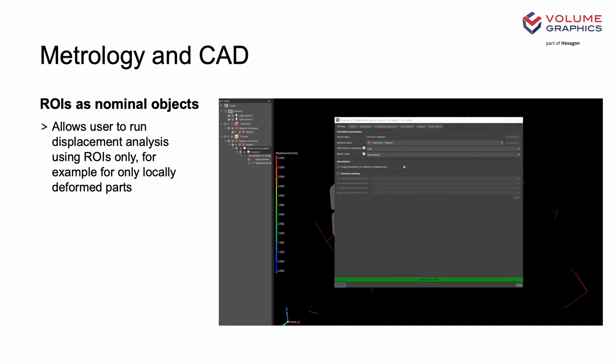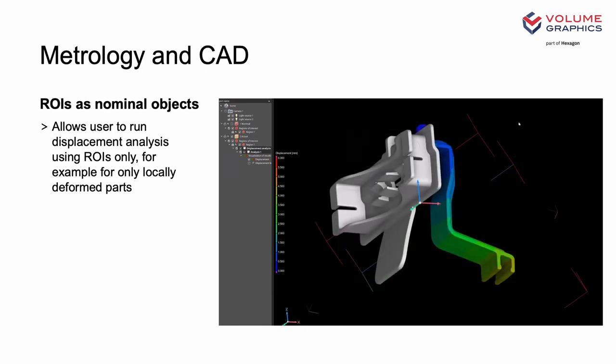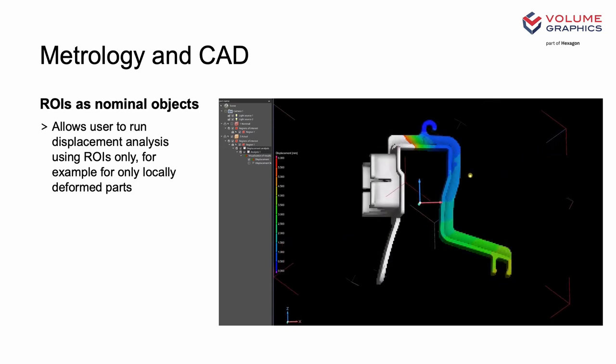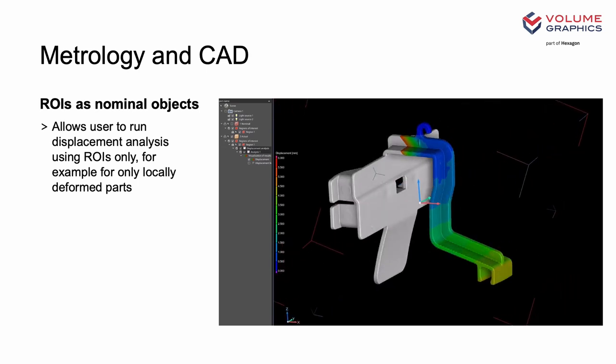In the last release, we introduced the new feature Displacement Analysis. This is a fantastic tool, allowing you to see where any movement has occurred between two different samples or samples in different states, giving a more detailed insight than the normal nominal-actual comparison. Now in the previous release, we were limited to applying this globally. Our customers quite rightly asked, can we maybe localize some of this? So yes, now we can. We've introduced the ability to use regions of interest, meaning you can limit the analysis to certain areas if you wanted a clearer idea of local deformations.